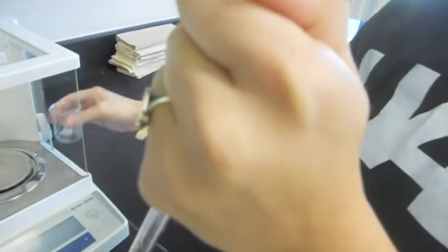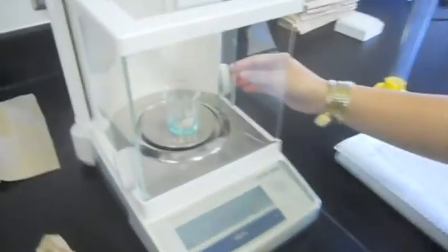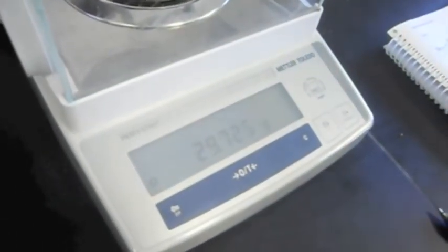You're going to subtract volume final from volume initial to get the volume that's transferred. Then you're going to measure this using the analytical balance. You get 30 grams.